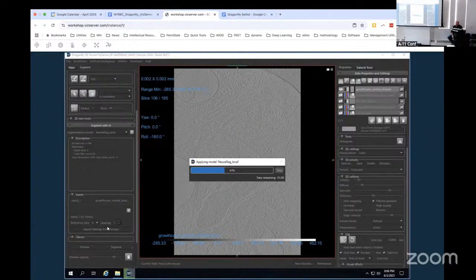Is part of it just because noise sometimes gets, I don't know, the contrast is radically different? Yeah. Dragonfly gives like the calibration process, and so when you change the signal densities by orders of magnitude, you can train a segmentation model on the data. Okay. But if you train it on noisy data, that is fun.